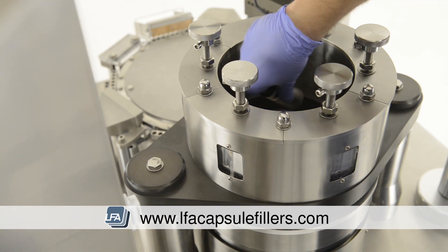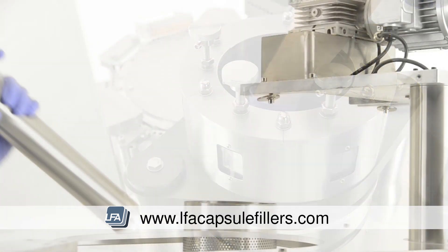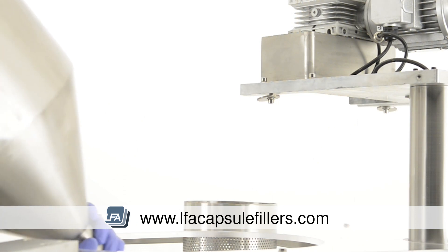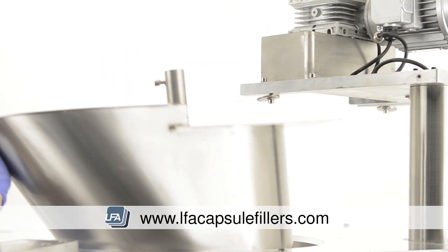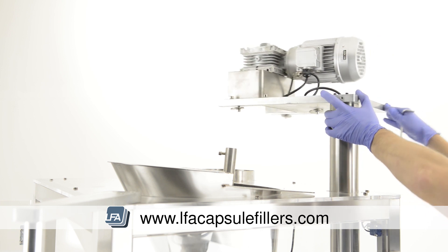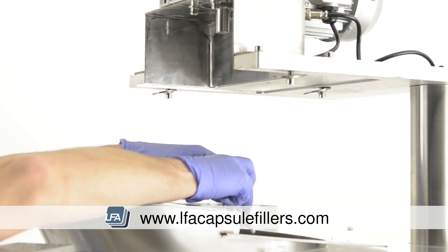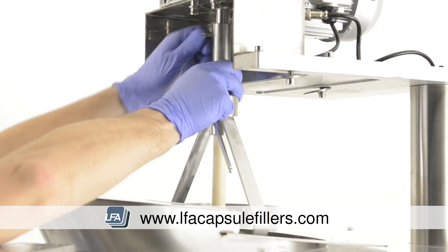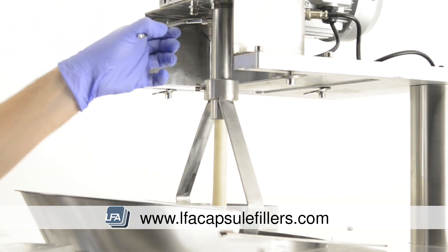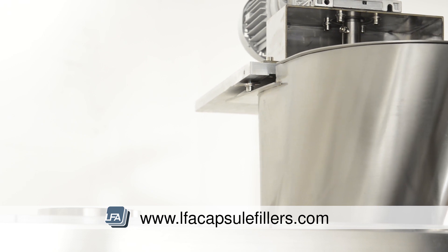Next, the sensor is placed back through the middle into the slot shown earlier. The hopper is lowered gently over the top, down through the centre section — keep the auger filler paddle inside the hopper. Now move the auger filler motor back over the top of the hopper. Lift the auger filler paddle out of the hopper and into position, then tighten the bolt at the top of the auger filler paddle. Raise the hopper into position and tighten the bolts to hold it in place.